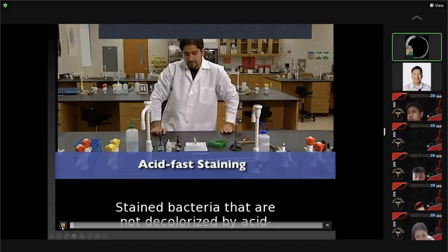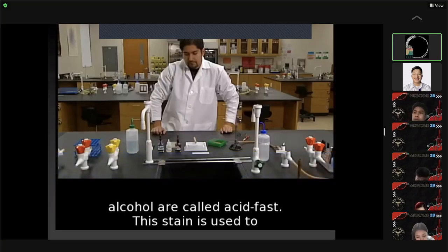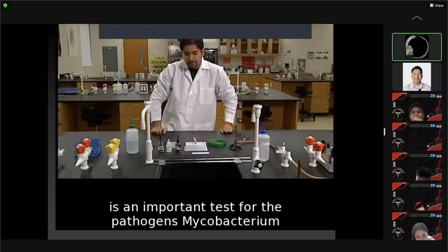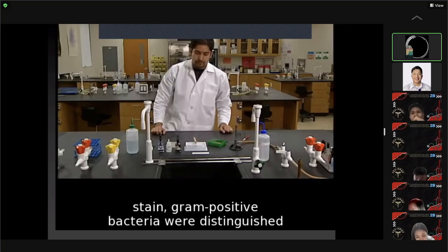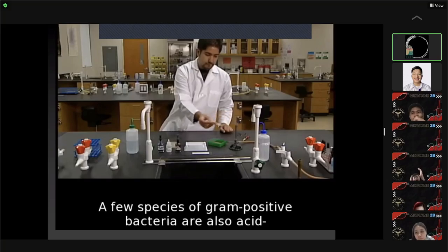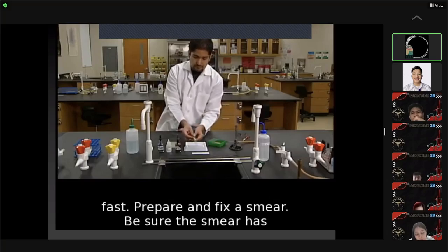Stained bacteria that are not decolorized by acid alcohol are called acid-fast. This stain is used to identify mycobacteria and nocardia. The acid-fast stain is an important test for the pathogens Mycobacterium tuberculosis and Mycobacterium leprae. In the gram stain, gram-positive bacteria were distinguished because they were not decolorized by acetone alcohol. A few species of gram-positive bacteria are also acid-fast.